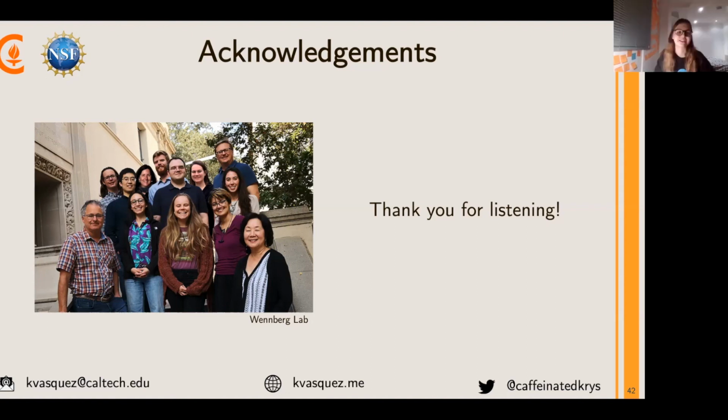Miranda asks, what would you like to see happen in the next 5 years in this field to build on what you've achieved? I would like to see, basically, the GC CIMS is a great instrument. It can use a little work. It is a little bit slow when it comes to measuring, because it takes maybe I didn't mention this, but about 20 minutes to elute a compound.